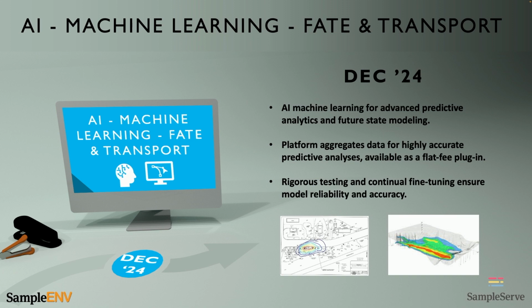This function will tell you what your plume or contaminant might look like in 2 years, 4 years, or even 10 years from now. This will allow users to not only determine the level of risk today, but also determine and evaluate your level of risk in the future. This AI product will also get smarter and more accurate as time goes on and as more data from more sites is input into the system.